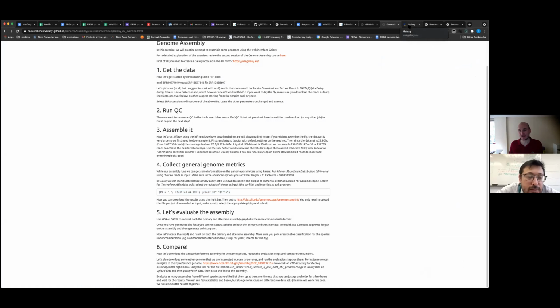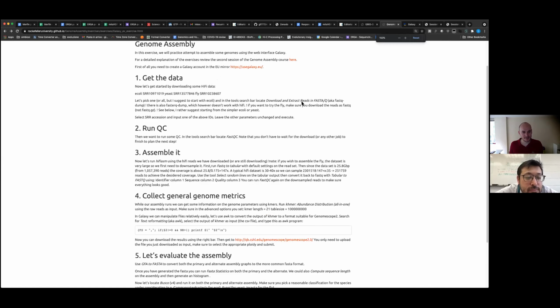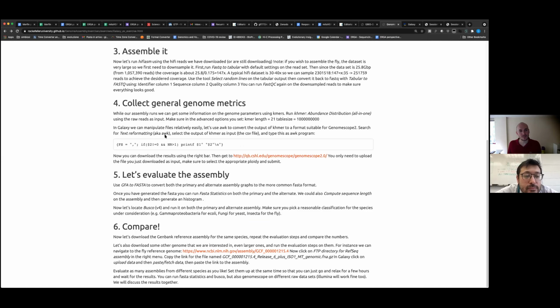Wait, can I try before, Olivier? I'm going to butcher it, but can I try? Okay. It seems to me like an if-then statement, but it's saying if you get this, and I want to say maybe it's referring to the quality score of one of your base pairs. If it equals this, then you're having it print something else.